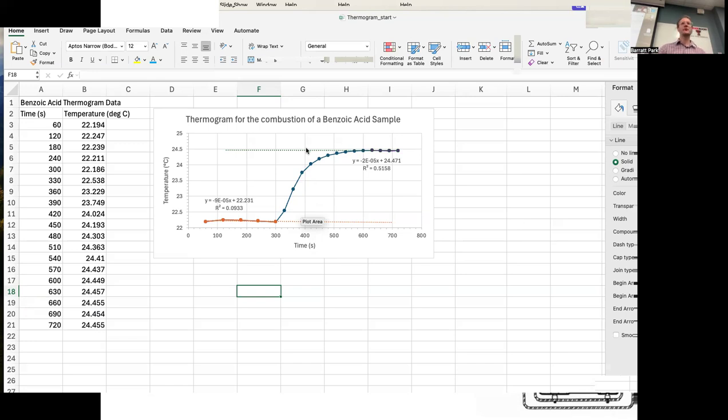Okay, so how do we do that? Well, if you read the procedure in the lab manual, they recommend that you print out your graph and take a ruler and try to estimate where's the point at which the rise in temperature is 0.63 of the total distance between these two extrapolated curves. You can do that. That method works great.